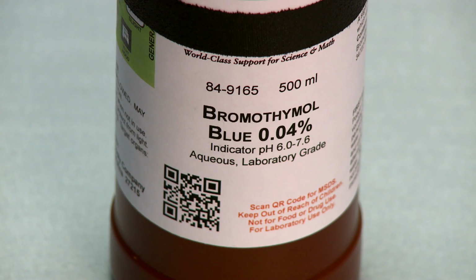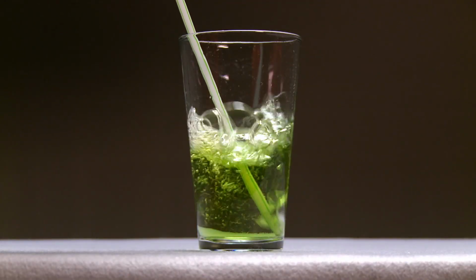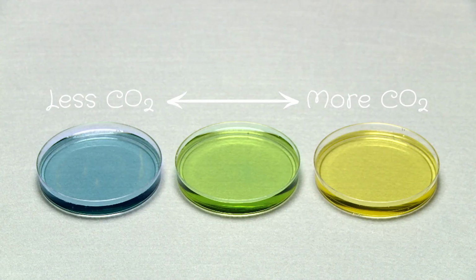BTB is bromothymol blue. BTB changes its color when carbon dioxide is added, like when you blow bubbles into it. We can use BTB to see if carbon dioxide concentrations increase in the air when the mealworms are eating.